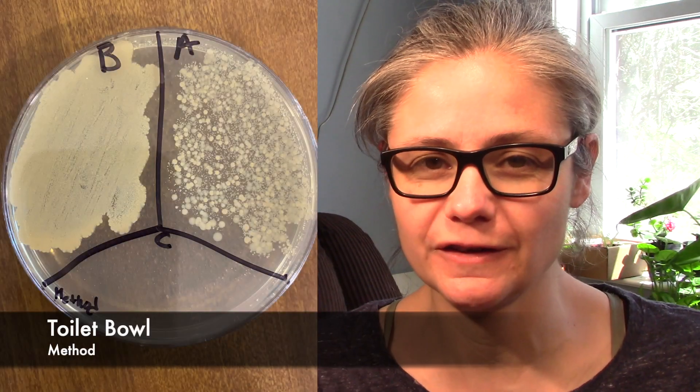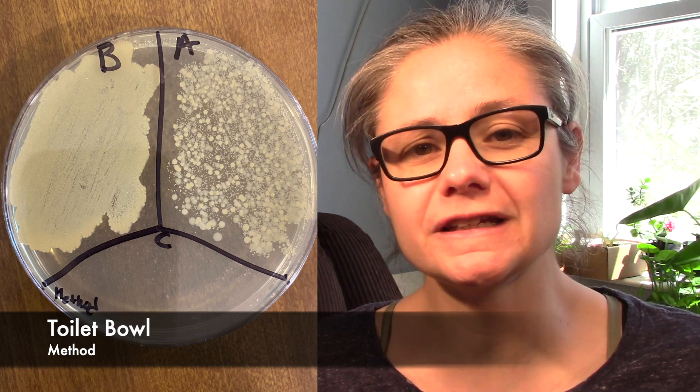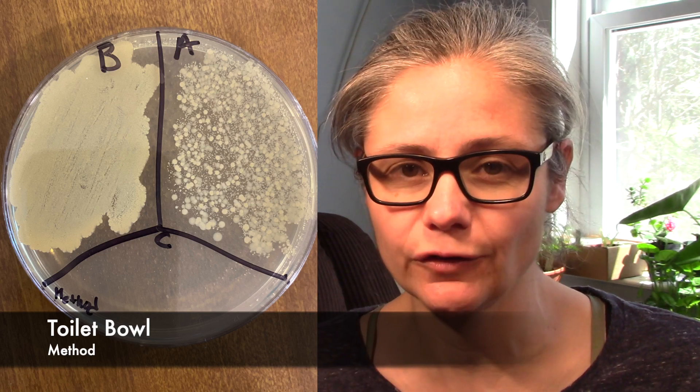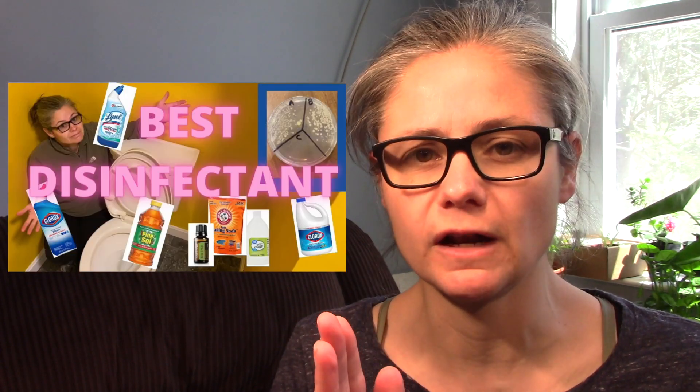Now for some results. As you can see in the before section, we have a lot of bacteria in that toilet bowl. In the after, it definitely decreased the amount of bacteria in my toilet bowl. It did not decrease it completely, but there is definitely a decrease. Comparing it to all the different toilet bowl cleaners I have tested so far, I would say Method is kind of right in the middle of that grouping — there are some that do better and some that don't do quite as well.